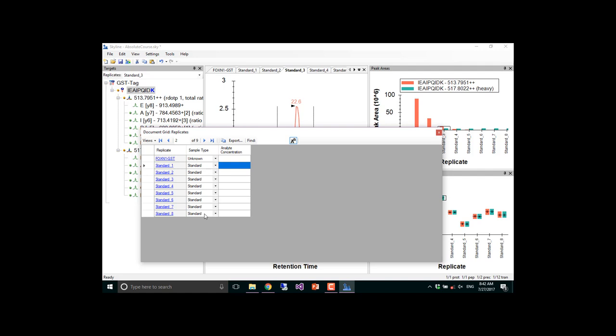So again, as Mike and Andy have tried to explain, if you just do that kind of internal calibration, there are lots of assumptions you're making that don't necessarily hold. The internal standard is not quantified accurately.